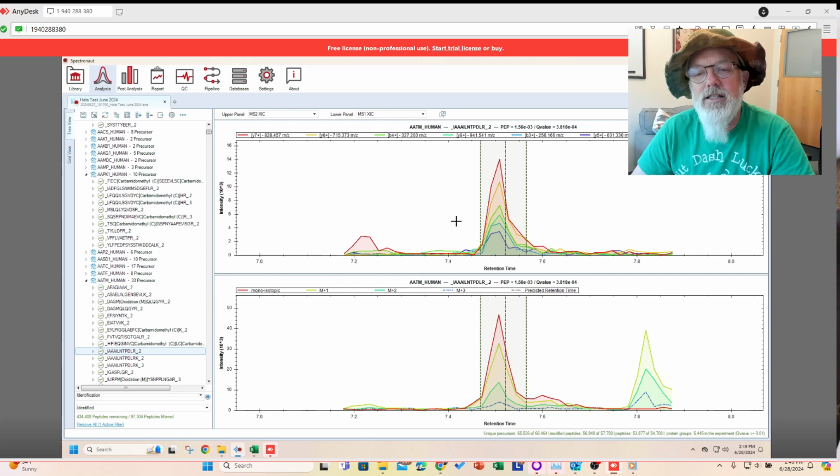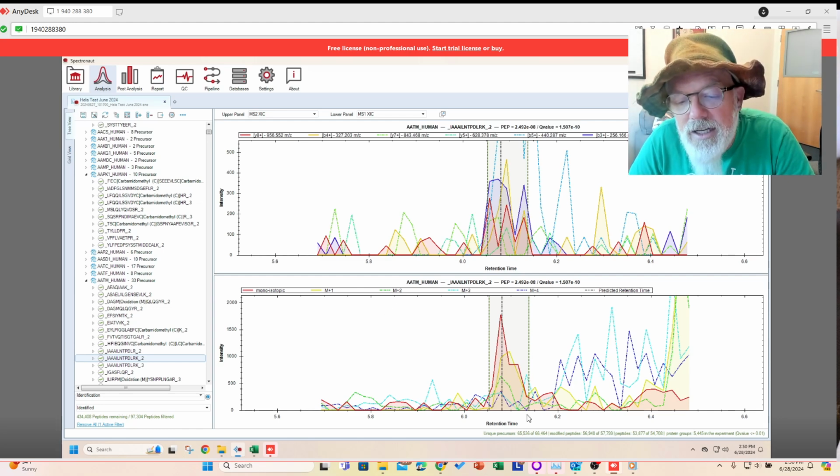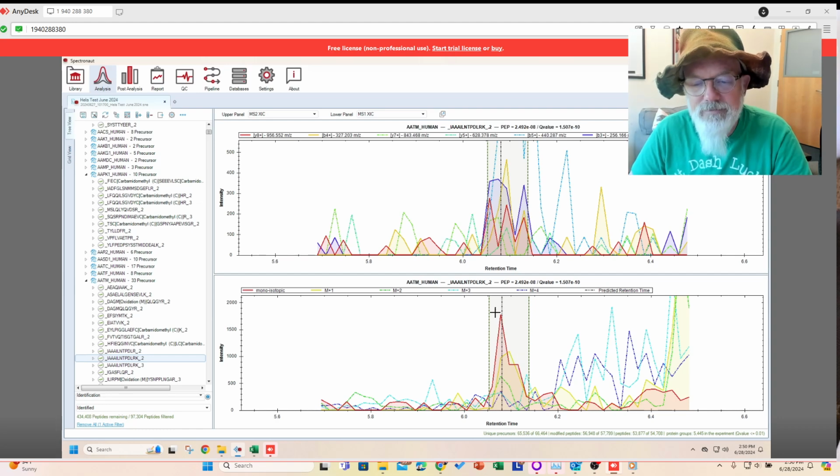And as far as I know, what deep quant does is, you can see how it uses these elution groups here. These are the fragments or the product ions from the peptide. And again, these are the precursors. You could go back to my earlier videos to look at that. And I believe DeepQuant helps pick which one of these to use, because there's a lot more B and Y ions than just these. And so it helps pick, especially when things are noisy. You can see how these are kind of dashed, and that means it's not using them. So that's the interference. If you look carefully at these signals, only the solid lines are the ones used for quantitation. The ones that don't really elute the same, the interference correction isn't used. And you can see only the monoisotopic and the isotope plus one is used.